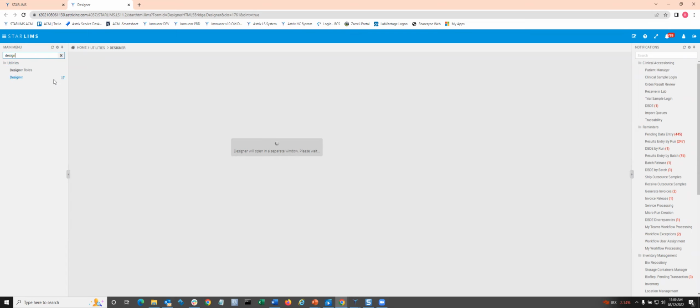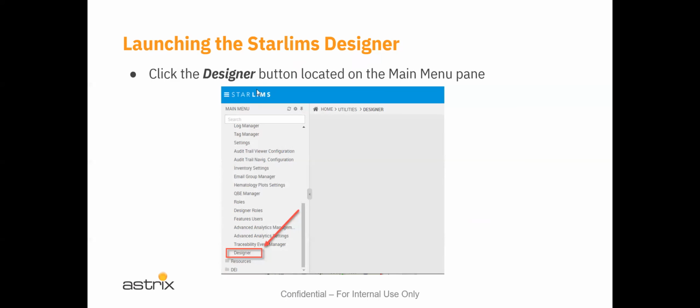A little sidebar note: when you click on the link itself, it replaces whatever tab you have opened here with the application that you clicked on. If you click on this little tiny sublink, it'll open up a new tab and not close the current session. That's a little tidbit of information. I would recommend using the side link over here. Okay, and that's what it looks like.